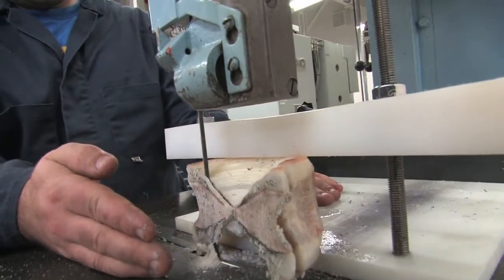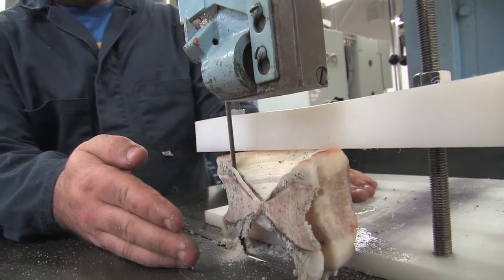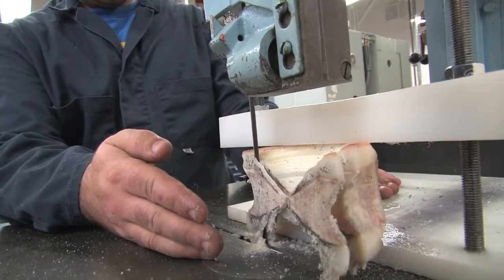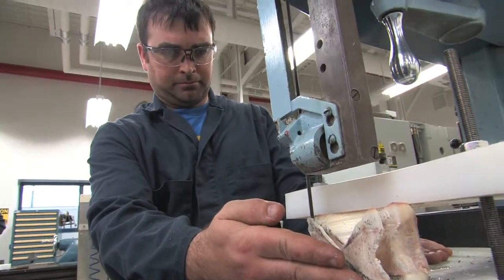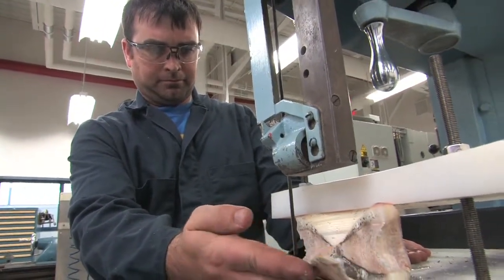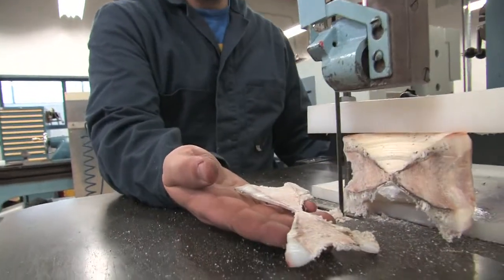You should be able to make one of the cuts directly through the center of the vertebra. Use care when handling the thin sections as they can be easily broken. It's also good to keep track of the sequence of the sections cut by marking or labeling them in some way.